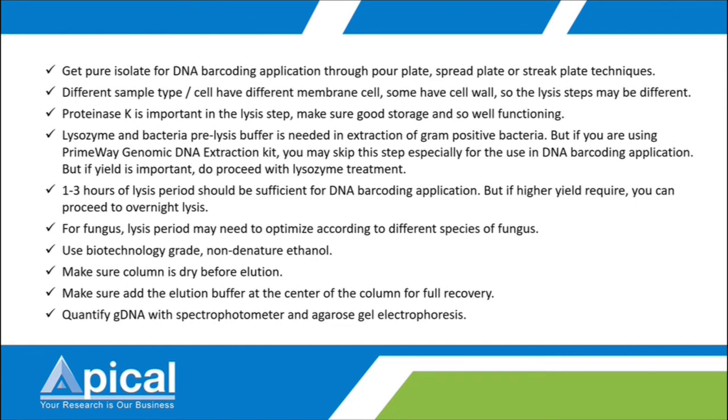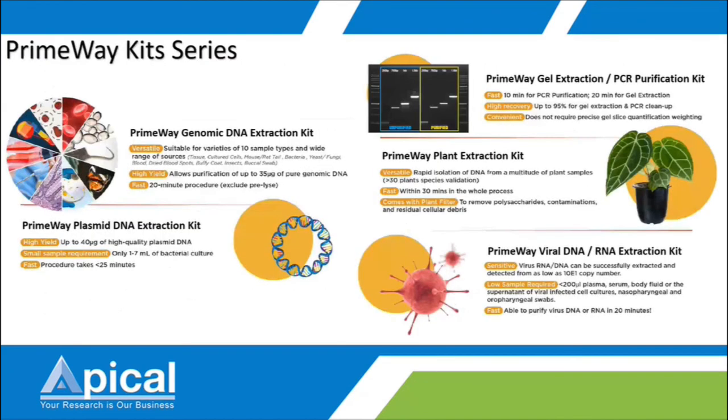I believe you have learned a little bit on what to expect in your sequencing results. But I'm unable to go into detail on the trimming and alignment. Maybe in future we can have a chance on this also. From today's webinar, we know that a good extraction kit will always ease your molecular work.